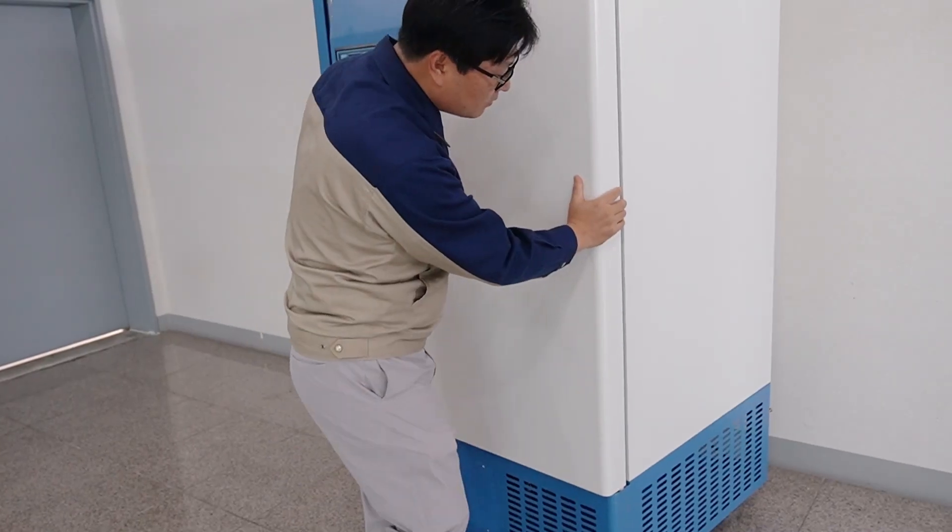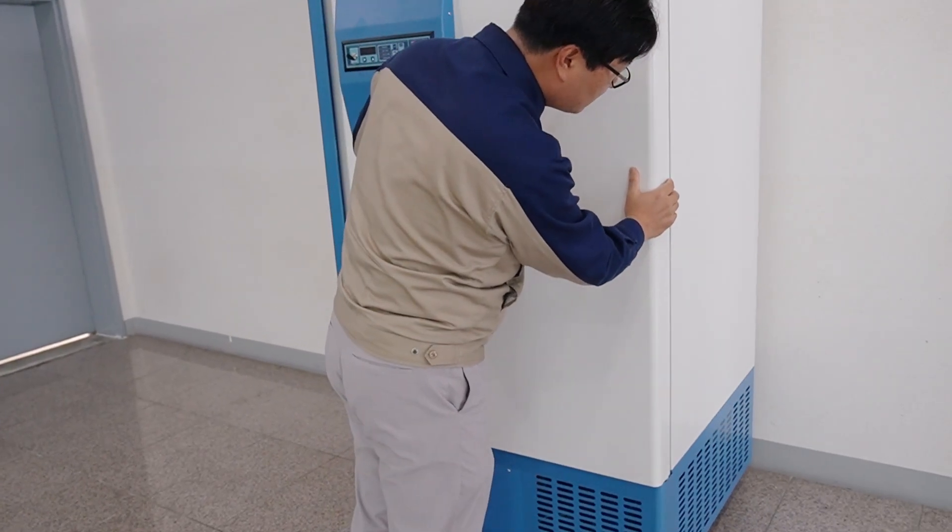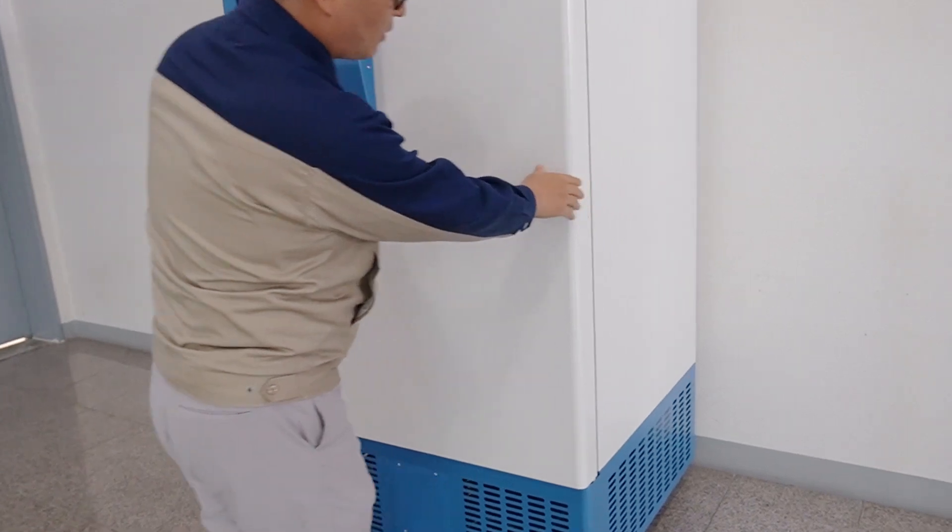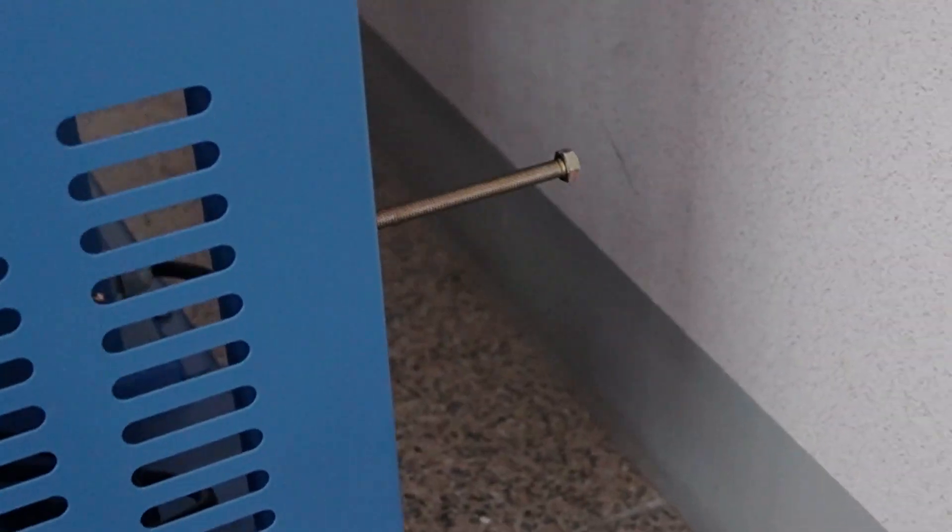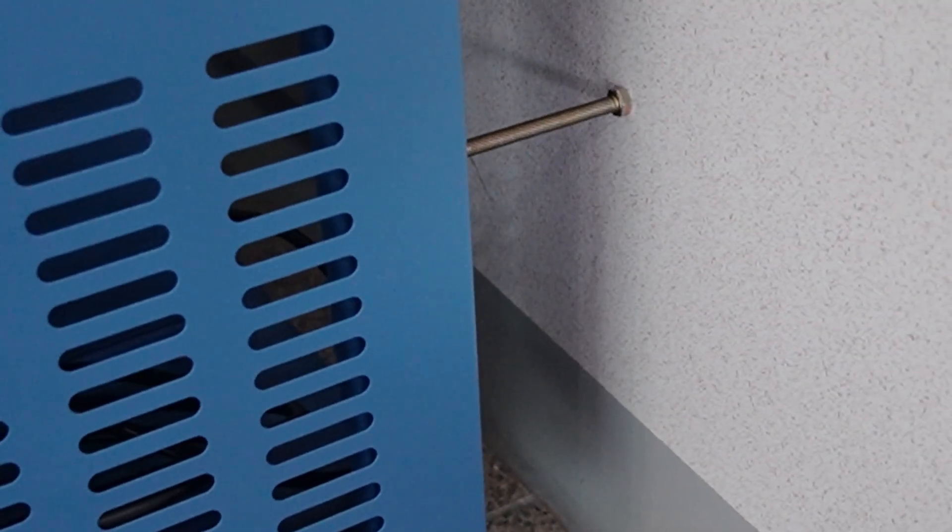Before starting, keep the distance from the wall by using bolt at rear side. This is to keep upper airflow for freezer.